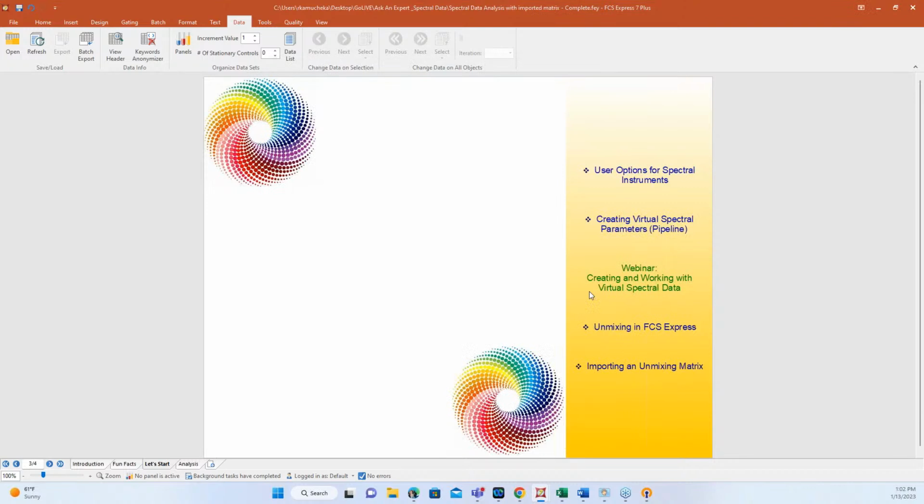Yep, that's one of the options that inspires panic in people when it's checked and then they go and look and see and they have no fluorescence parameters, right? Yep. So not to panic, just go and check like what Robin said.